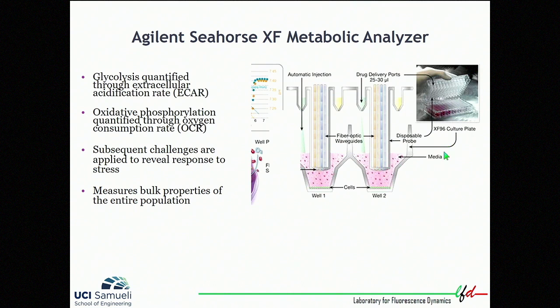We can actually monitor to see if the metabolic changes inferred with our FLIM imaging correlate with other types of techniques, including the Agilent Seahorse metabolic analyzer.